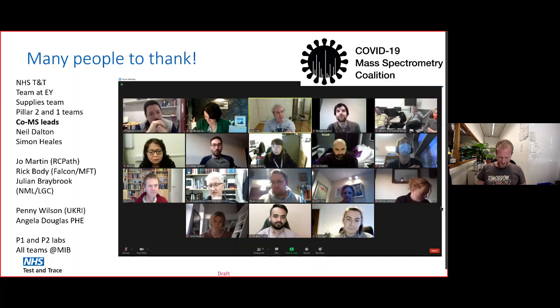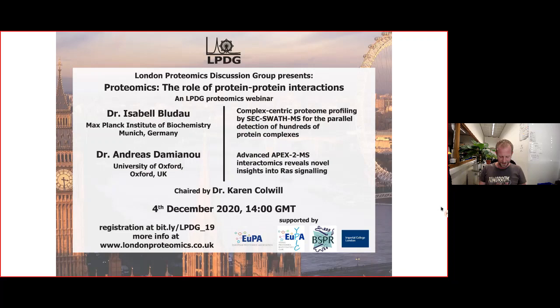This has been an amazing lineup and a very nice overview of what proteomics is doing. Let me first just share the little plug that Perdita just gave us. We are sharing the manuscript of our essay as a sneak preview here in the Slack channel for those of you interested in what triple quadrupoles might be doing in the very near future. And if we look at it, we've seen basically proteomics working in diagnosis, helping to do prognosis and even helping to look for a cure.